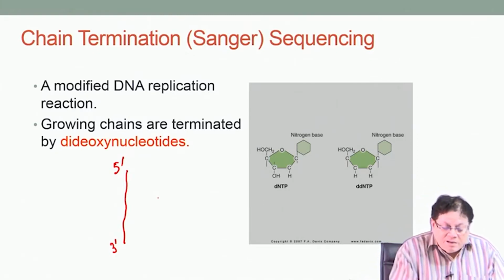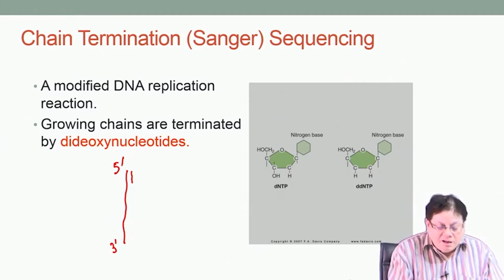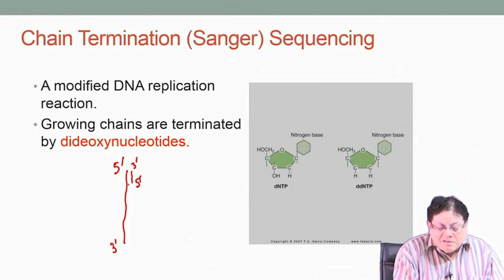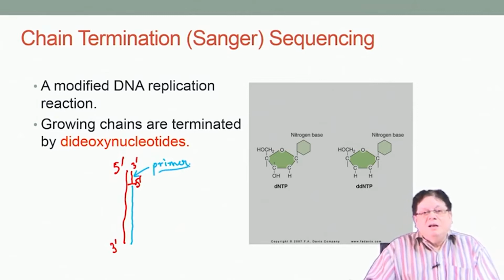One is that DNA polymerase works only when there is a small piece of DNA attached to this primary piece of DNA. Primary means the one for which you are trying to determine the sequence. So, a small piece of DNA needs to be attached, and then DNA polymerase can start from there and make the remaining part of the chain. This piece is called the primer. It is made up of deoxyoligonucleotide, so this is a DNA primer.